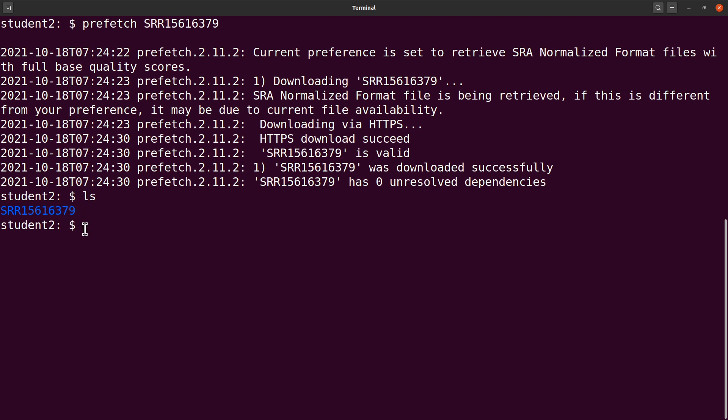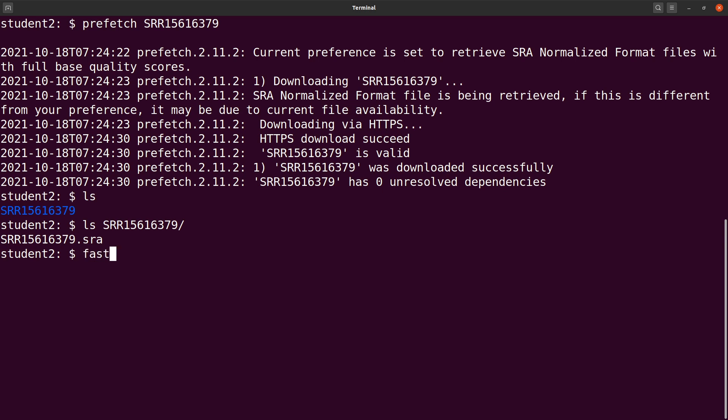Let's do an ls and you'll find your file here. ls into it and you have your SRA file. So now we use fastq-dump to extract. We say fastq-dump, we type our accession ID.